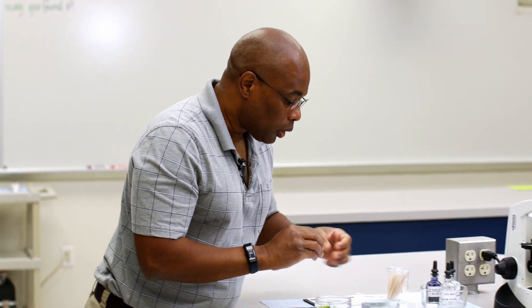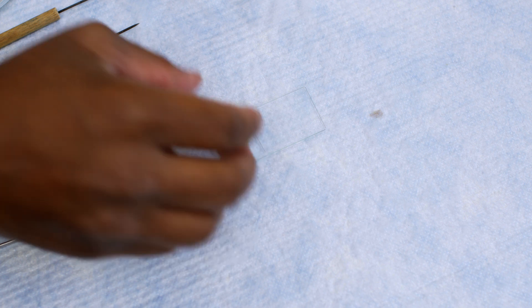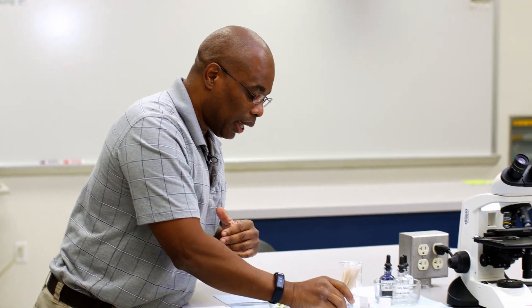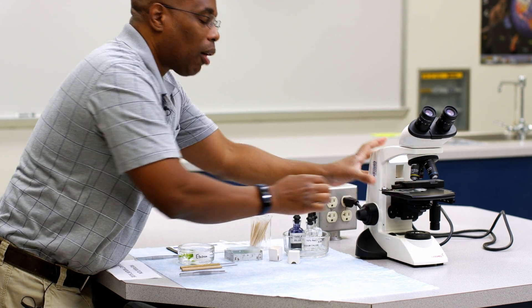At this point, it's important that you engage in proper technique. Because we're looking under the microscope, if half your sample is in air and half is in water, you will not be able to focus on the full sample because air and water have different refractive indexes. So we want to ensure that we remove all the air from our sample. You're going to angle your cover slip, slide it until it touches the water, and then let it drop. This forces all the air from under the cover slip as it slowly drops onto the sample. Now you have a nice wet mount with no air bubbles, ready for viewing under the microscope.